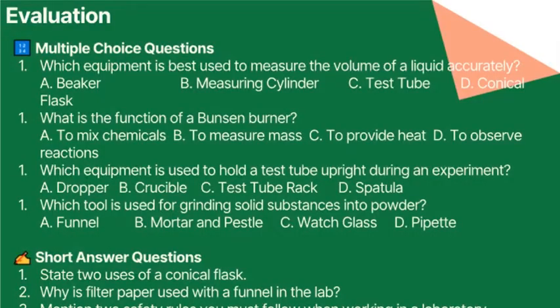Let's test what you've learned. Question 1. Which equipment is best used to measure the volume of a liquid accurately? Question 2. What is the function of a Bunsen burner? Question 3. Which equipment is used to hold a test tube upright during an experiment?